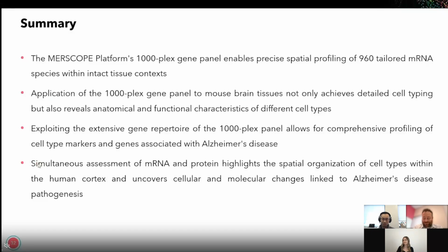So maximum runtime, if we max out all of those settings there, it's approaching 65 hours, which again, that's maximum tissue area, cell boundary stain in all of the auxiliary channels, which is, you're getting a lot of information there. So yeah, it approaches 65 hours, but nothing absolutely crazy there.